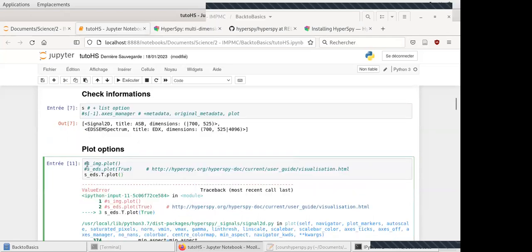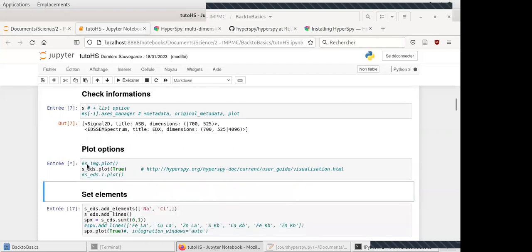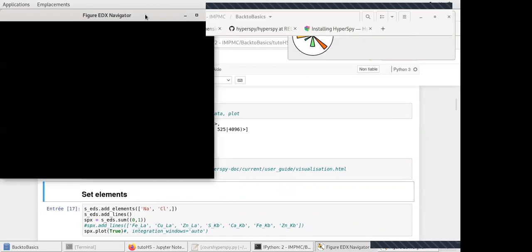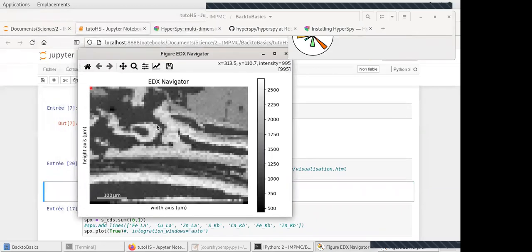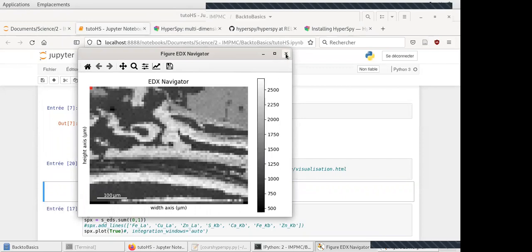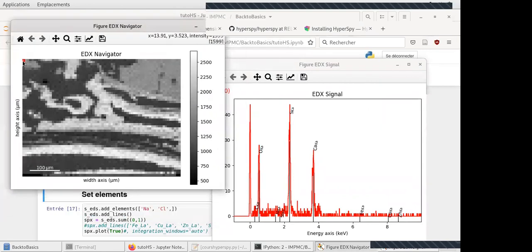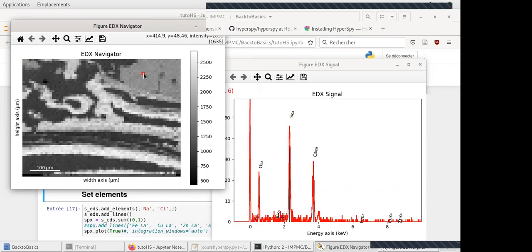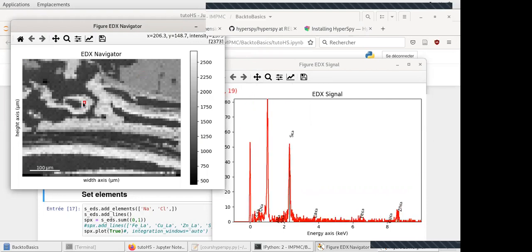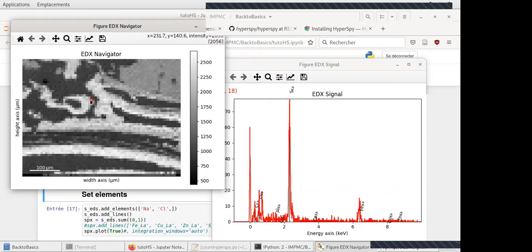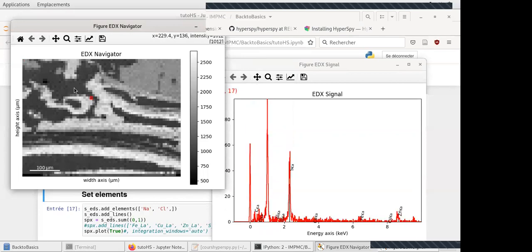After loading with those parameters, you can see the image resolution has decreased. But now on each pixel you have a spectrum-like signal. When you go to different areas — here you see calcium, sulfur, and oxygen; here you see mostly zinc and sulfur; here iron and sulfur; and here carbon.